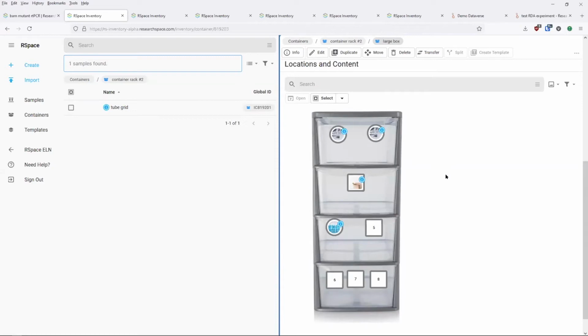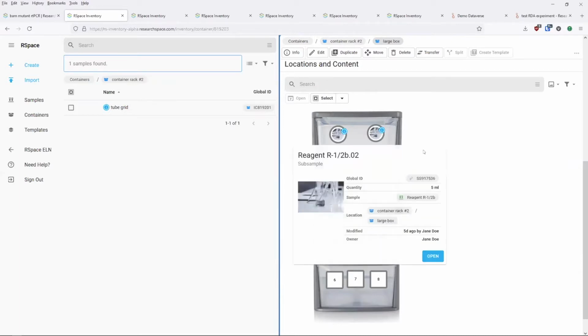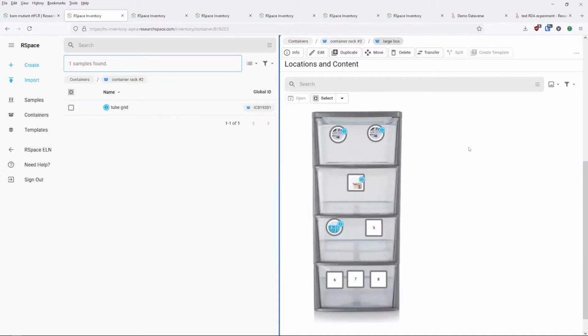So I'm going to take a picture and I'm going to set a few locations in the system. Okay, this first row can only handle 2 locations. This one can only handle 1, and so on. And then I can move the specific aliquots or containers into this bigger container, again, really enhancing the visuality aspect of an inventory system, which is really important.